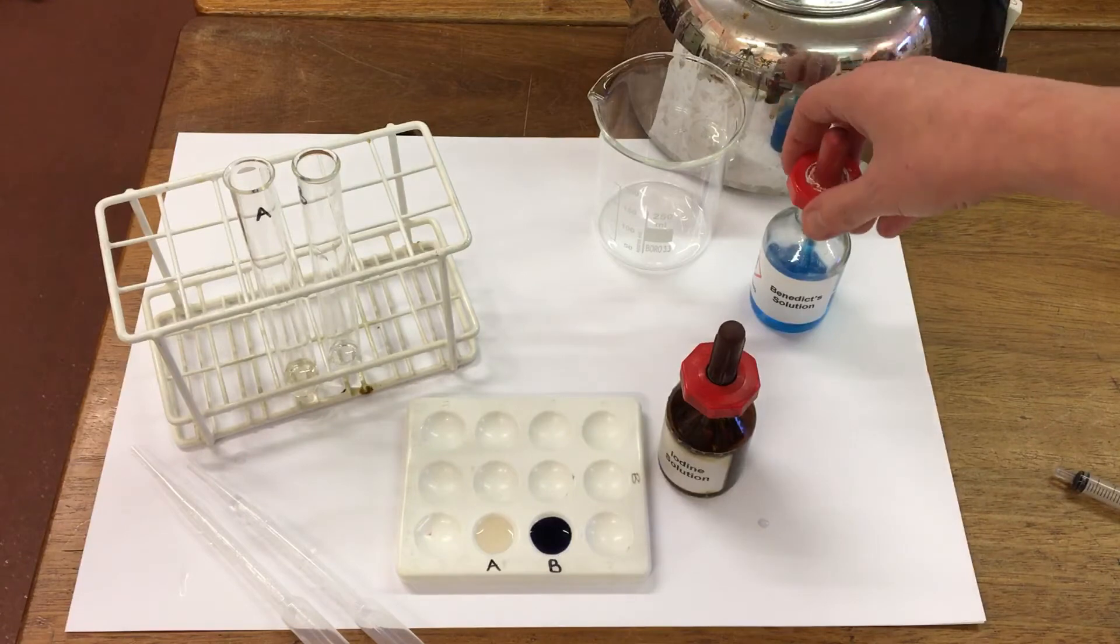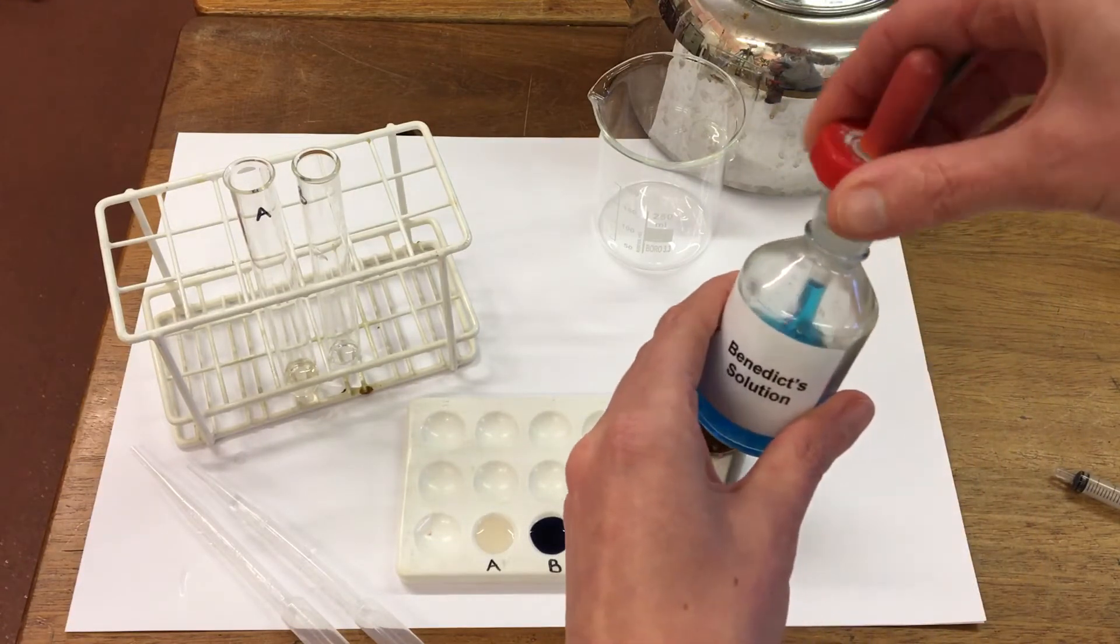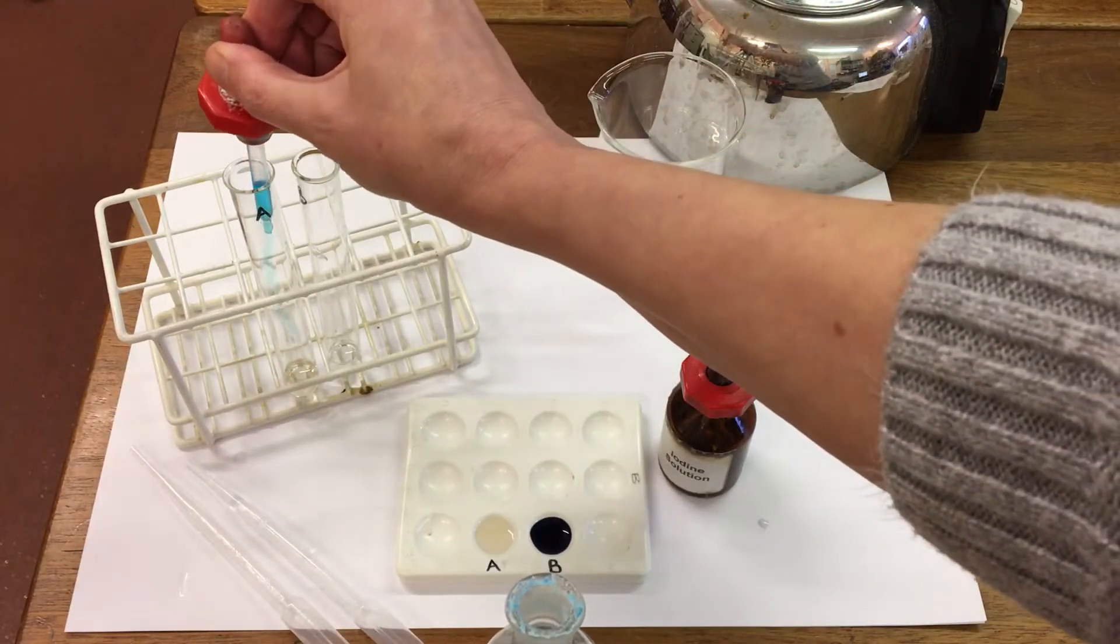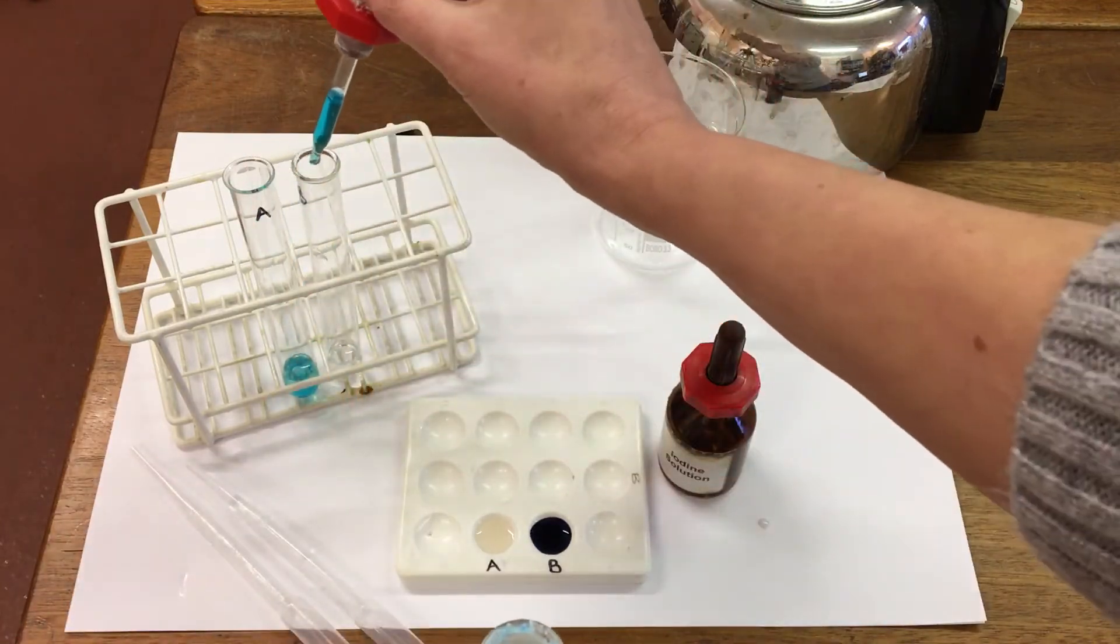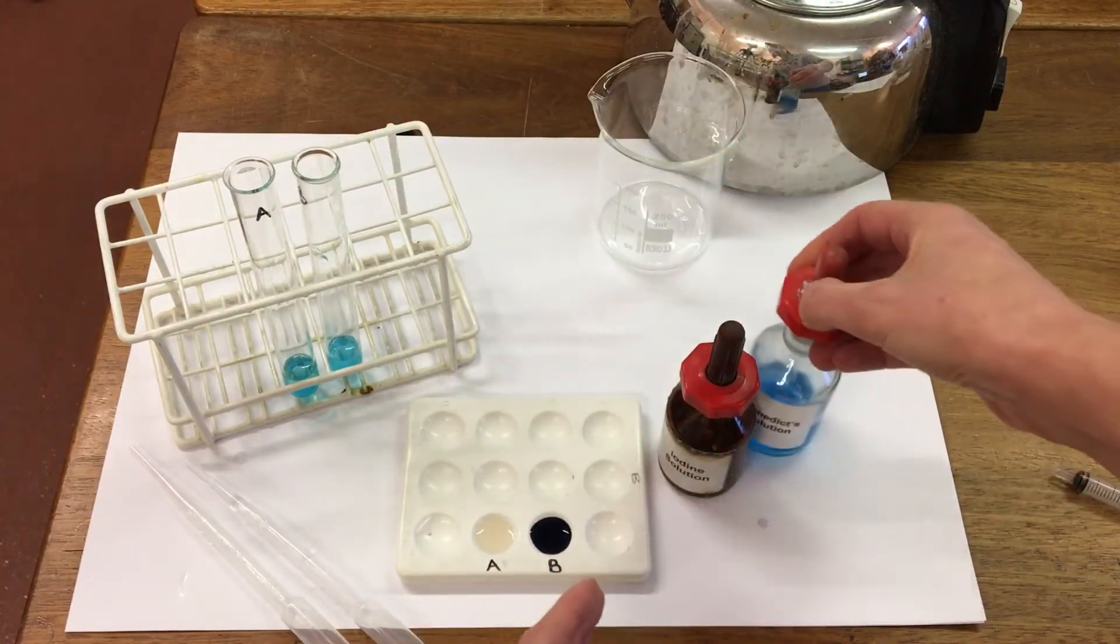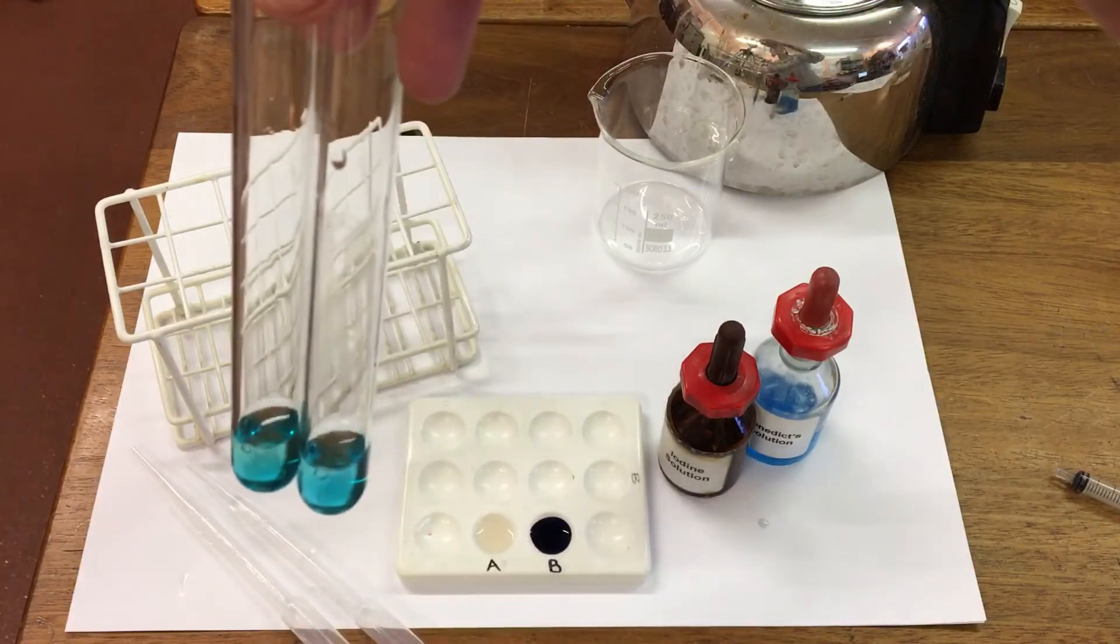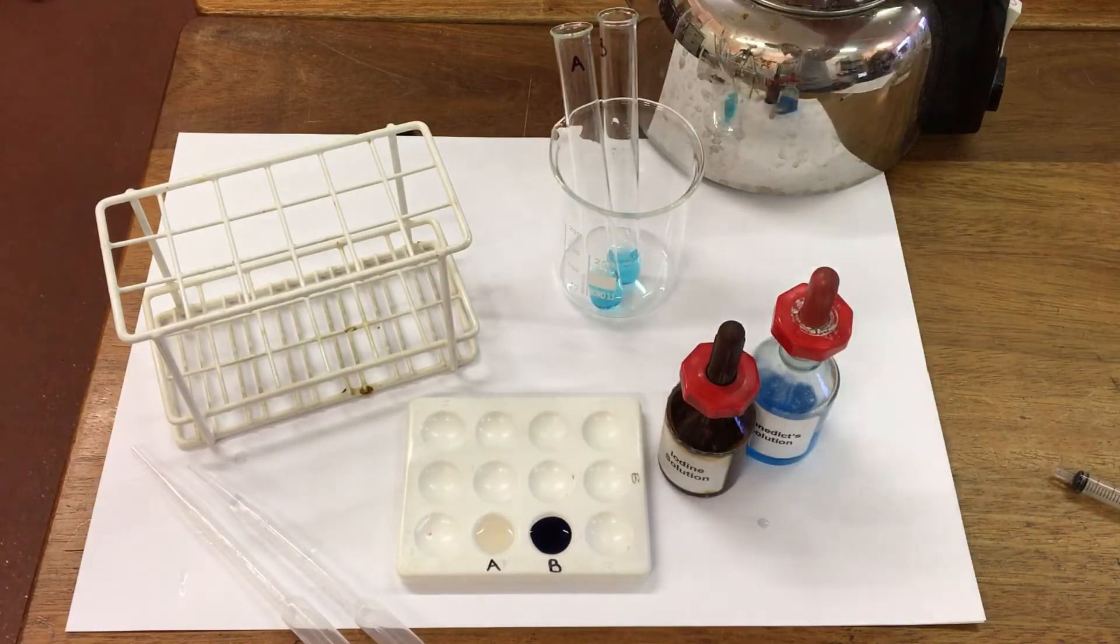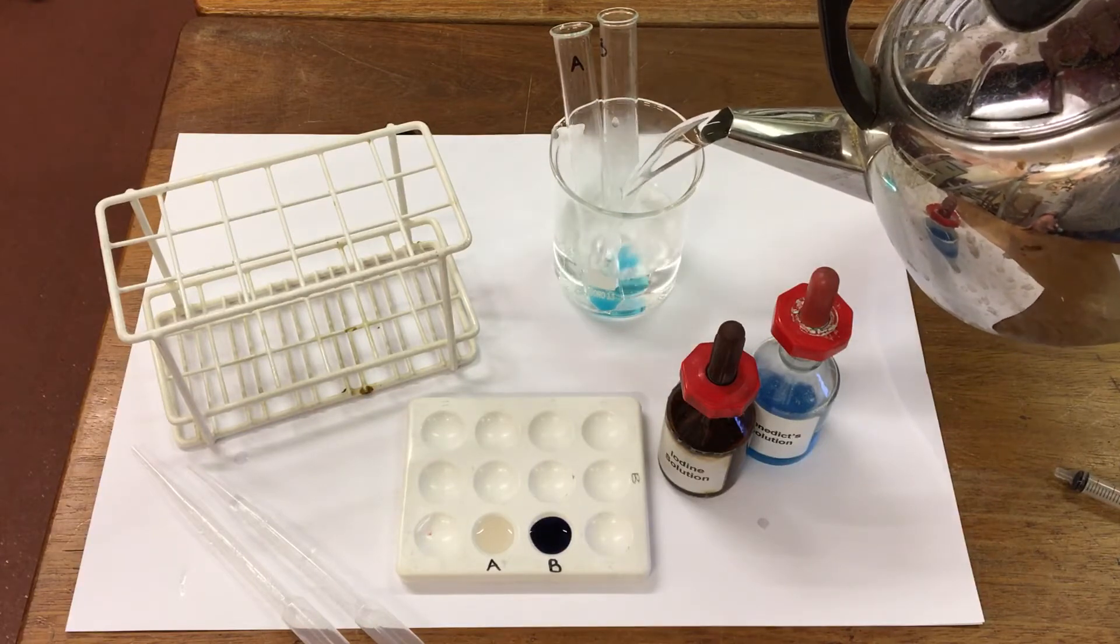We're then going to use Benedict's solution to test for glucose. I'm going to add some Benedict's into A and some into B. Gently mix the test tubes so we can see the blue color. I'm then going to add some freshly boiled water, and we're going to watch for any color changes.